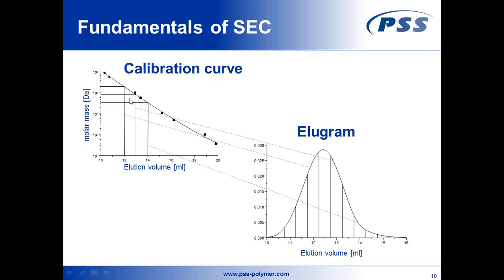If you have measured proteins of a given size, and you measure the retention time of these proteins, then you can combine your elugram and your retention time for the unknown protein in terms of size, and you could slice-wise, as indicated here, correlate the molar mass of these slices to the calibration curve in the back, and then for each slice you can get your true calibration curve, and if you take an integral overall, you can calculate the overall molar mass of your unknown sample by having a calibration curve at the given column set in the background.